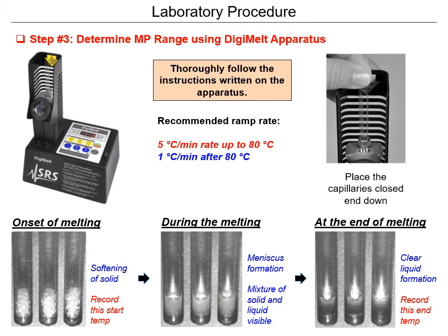So once you have put your sample into their capillary tubes, you move on to this machine right here. This is known as the melting point apparatus. This is one of the digital fancy ones that are found in the undergraduate labs. You'll see here there's a set of instructions for how to use them. They have automatic ramp rates and all of those things. You'll notice here there's a little glass to view the sample, which is like this. And there are 3 little slots where you can put your capillary tubes. So they're hard to see here, but you can put them right there.